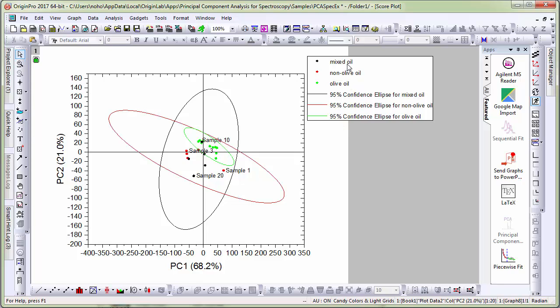Here you see that the app used the group info from the comments column to distinguish the data and what is plotted here is the principal component 1 versus 2.